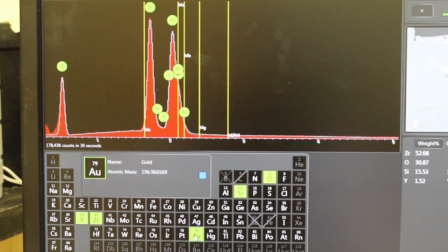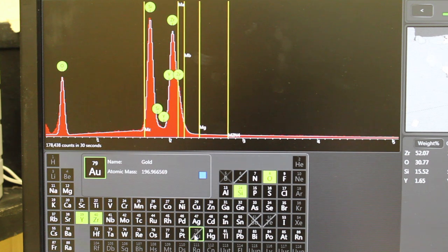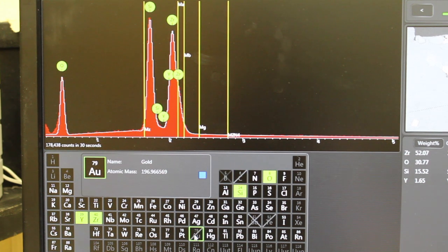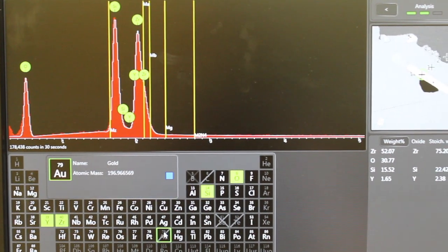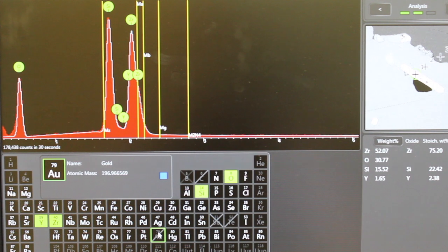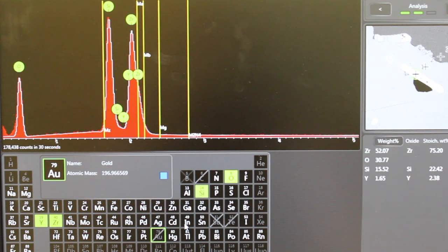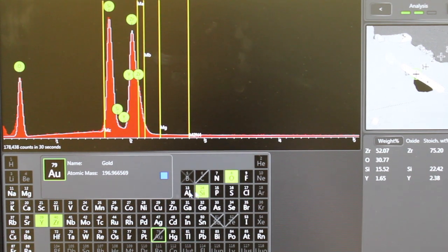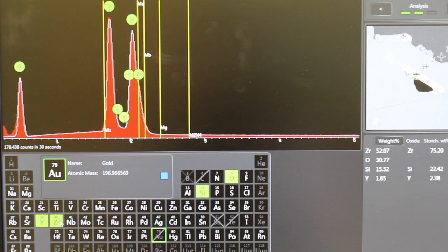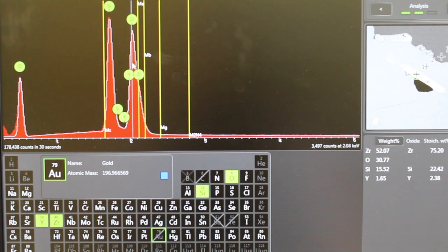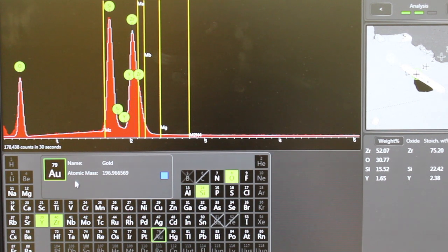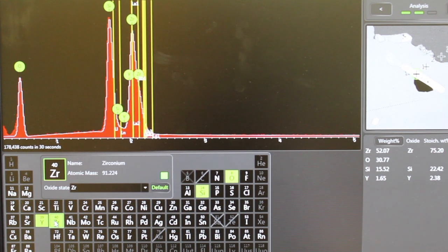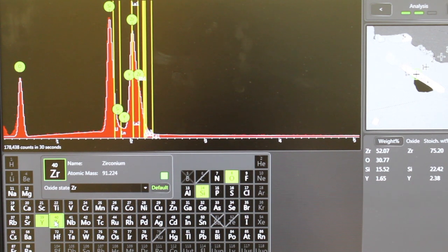Gold may be another example. However, we should be pretty excited here because we seem to have zirconium. We can click on the zirconium peaks and see that we have zirconium peaks. We can click on this and see what the zirconium bands are.